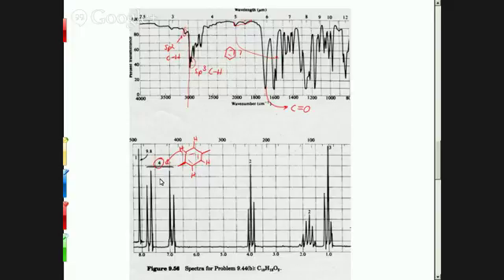So that's why they lump all this in as one with 4 hydrogens also. I think you've all got 4 also, right? Like one and then 3 that are in that region. So you'd expect 4 hydrogens. If you've got an aromatic region with 4 hydrogens, that tells you it's got to have 2 connections because 4 hydrogens leaves 2 to make 6 carbons. If you had one with 5, then you'd have just 1 connection, and so on.